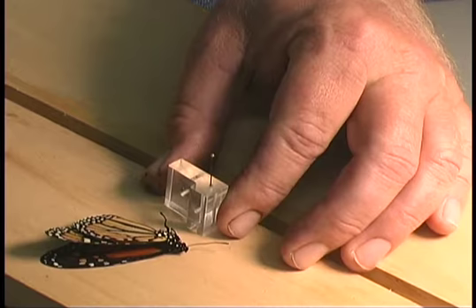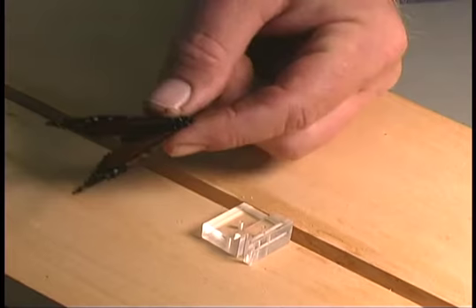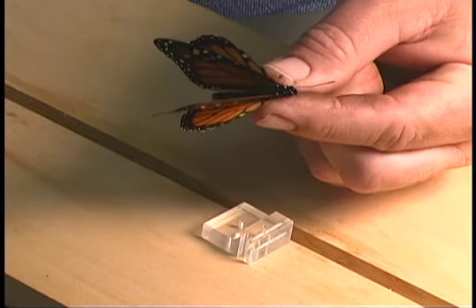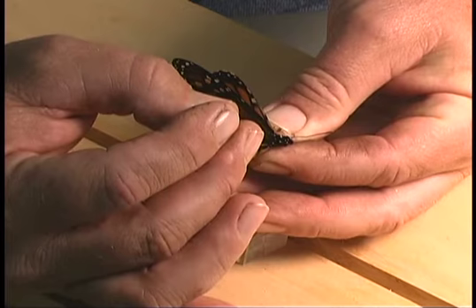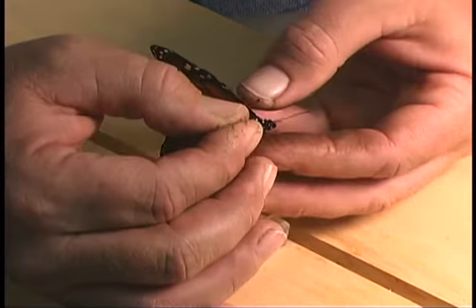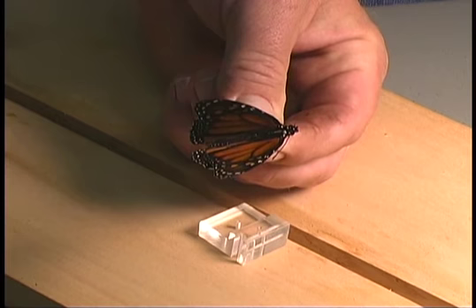First, pick up the insect on the sides of the thorax. On Lepidoptera, if they are recently collected, their wings will be fairly limp. If you gently squeeze the sides of the thorax you can see the wings will start to open. That will allow you to come in with the pin and insert it into the center of the thorax. Try to center the pin as close to the center of the thorax as possible, then push it all the way through until you can grasp the pin from underneath. Then look at the insect from the front and from the side to see that the pin has been inserted straight.